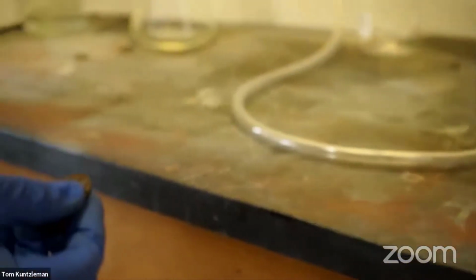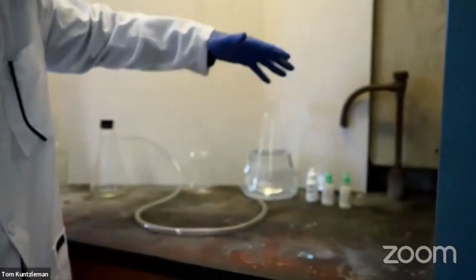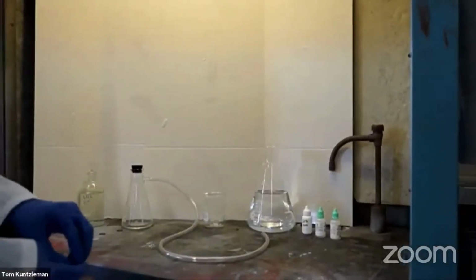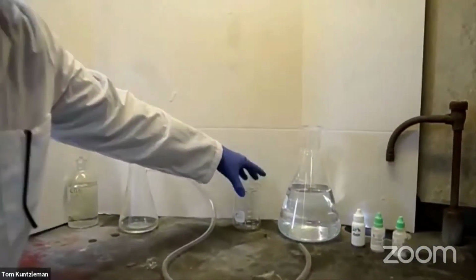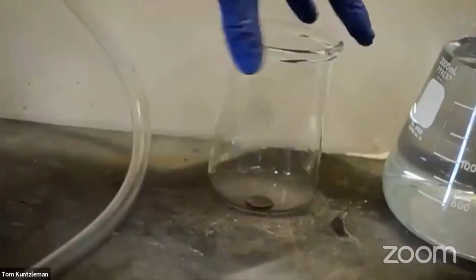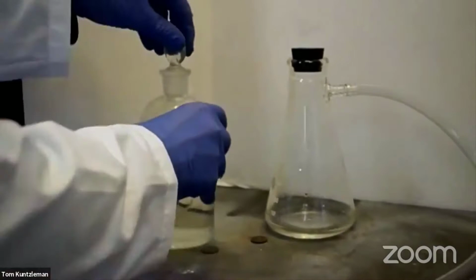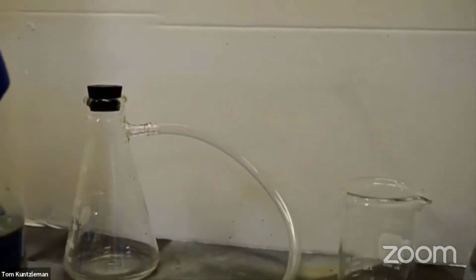If you hear a little humming in the background, the humming is the hood at work. So the humming is the pump pumping the air through here and out into the atmosphere and away from the experiment. So go ahead and take this beaker here, and let's put our penny in. Turn it this way, yeah. And then I'm going to add some concentrated nitric acid to our penny. We're going to watch what happens.